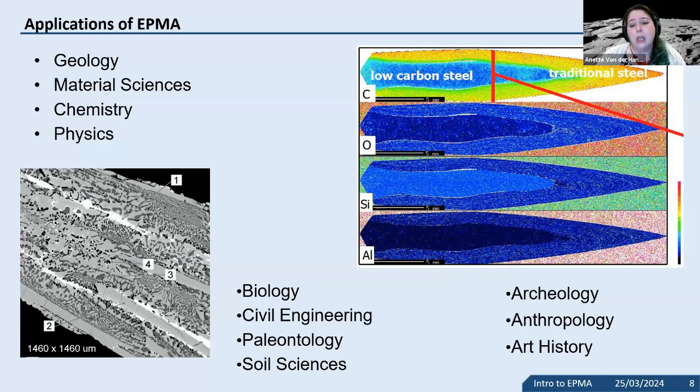And essentially, in terms of samples, we can analyze any material that is solid and that is vacuum stable.